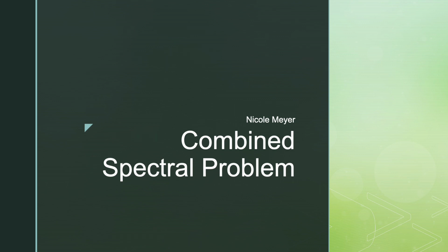Hello, my name is Nicole Meyer, and I'm going to be going over how I came up with a proposed structure using a given molecular formula and some NMR tables and an IR table.